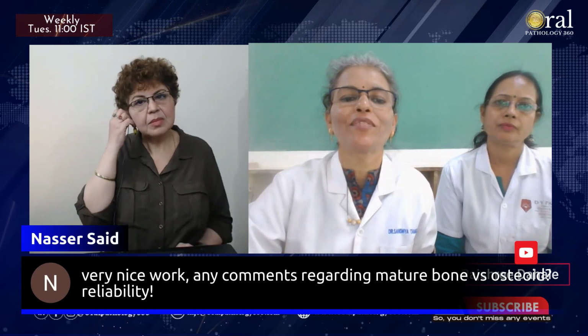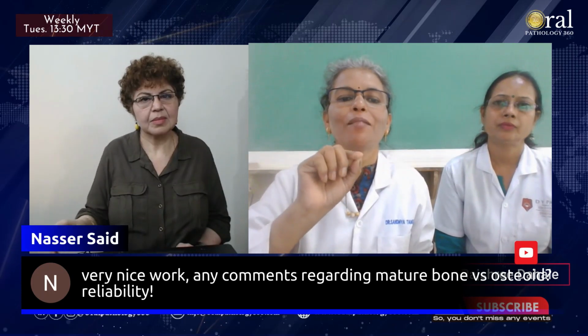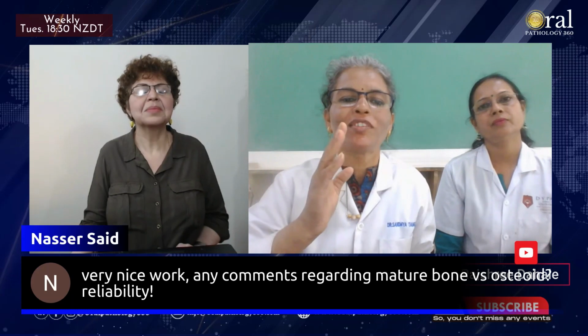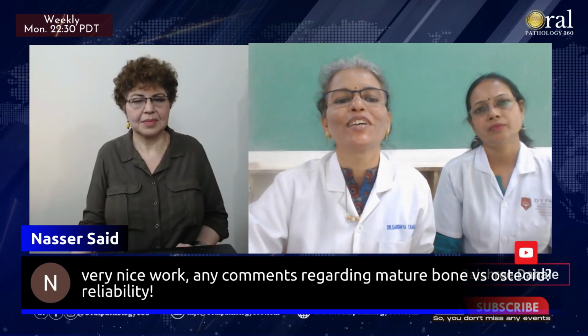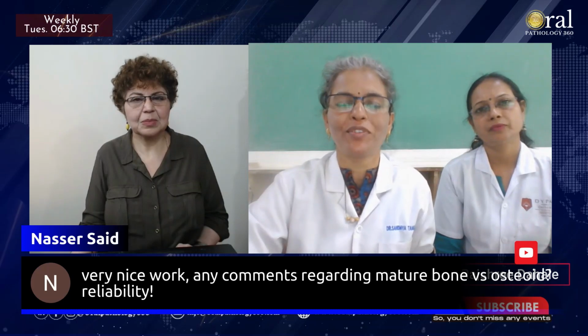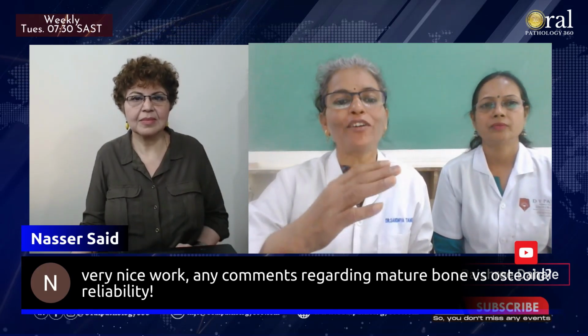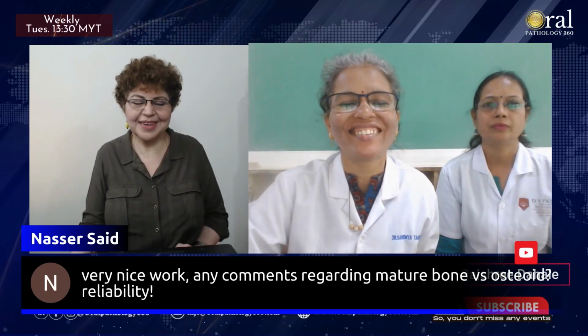In some calcifications, the mature bone was green, but osteoid was showing a little reddish in color, because the grade of calcification is closer to cementum. So we mentioned this hypothesis: it could be that this Gallego stain gives the grade of calcification also. Hope I'm clear. Yes, you are.